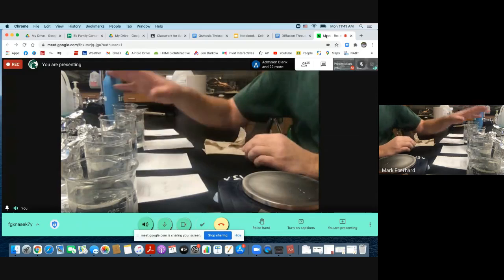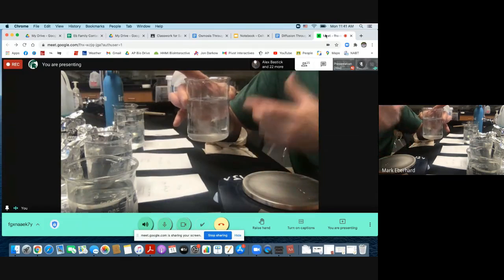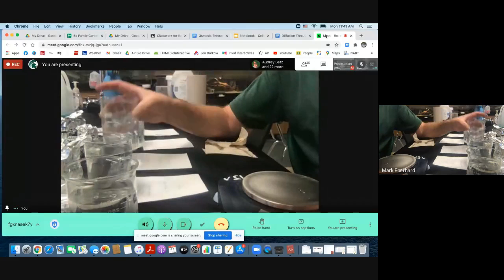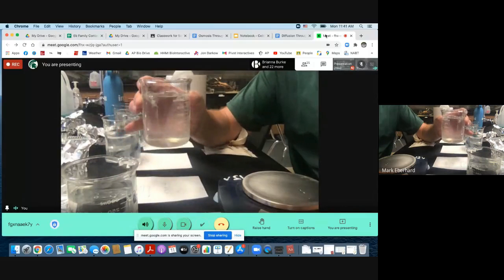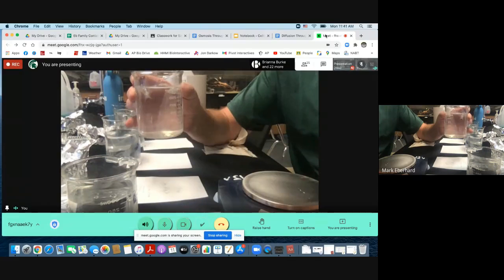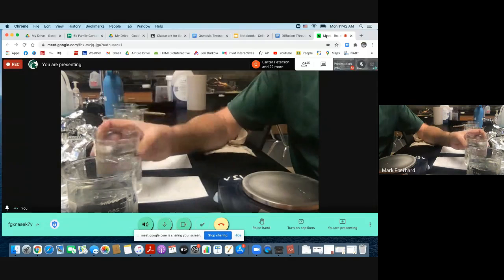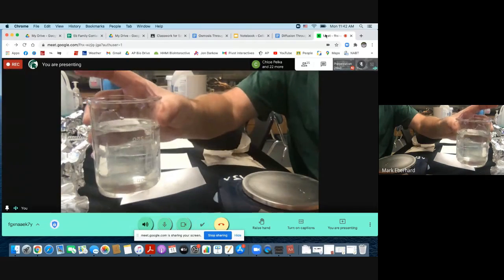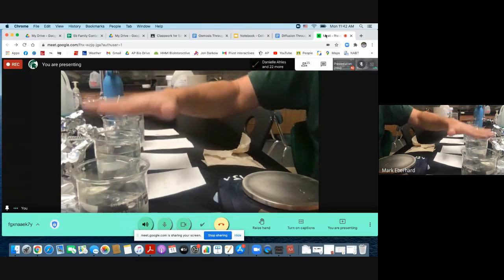I then had a third one, which is only water in the tube, water in the beaker. Nothing but pure water in the model and pure water in the beaker. This one flip-flopped because now I put pure water in the tube and I put 0.3 sugar water in the beaker. This environment has sugar. And this is tube with water and the beaker has 0.9 moles sugar. So that's A, B, C, D, and E.